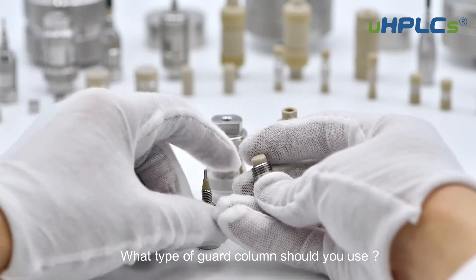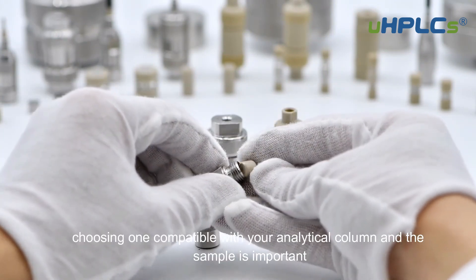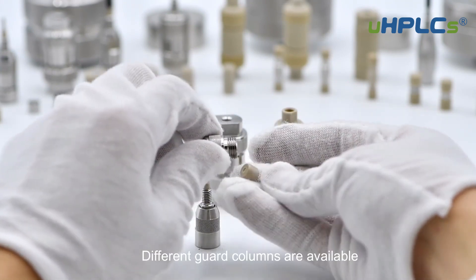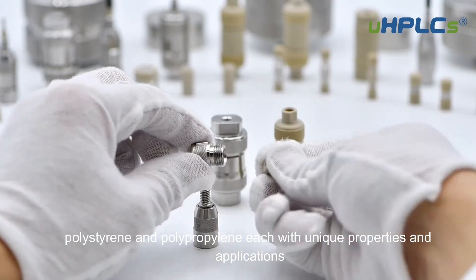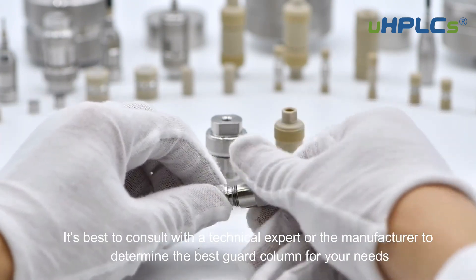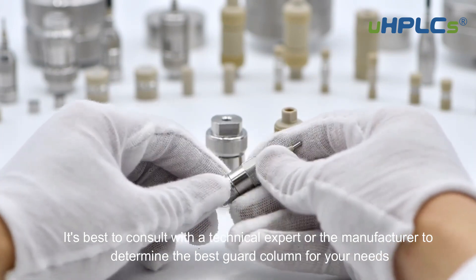What type of guard column should you use? When selecting a guard column, it's important to choose one compatible with your analytical column and the sample. Different guard columns are available, including porous silica, polystyrene, and polypropylene, each with unique properties and applications. It's best to consult with a technical expert or the manufacturer to determine the best guard column for your needs.